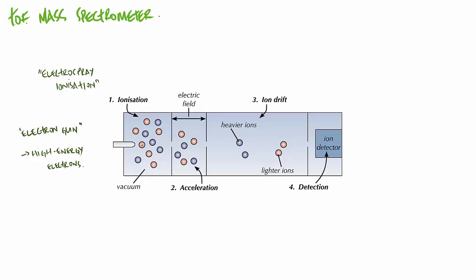I'll mention later on this idea of m/z value. If they wanted to put in 2+ ions, they could do as a sneaky little question, but it would be within the mass spectrum that's produced from all of this that you would be able to tell some of that. So 1+ ions is what you need to be thinking about. So we've put our sample in, we've taken an electron gun, we've bombarded the sample with high energy electrons, and electrons have been knocked off, creating an ionised sample.